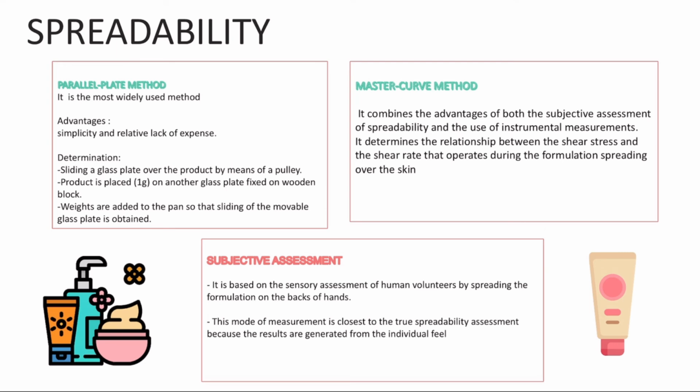Third method is the master curve method. This method combines both the advantages of subjective assessment of spreadability and the use of instrumental measurements.